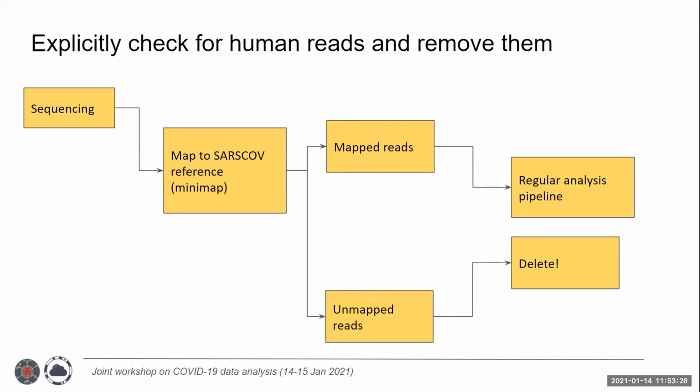The simplest solution is just a simple workflow like this, where you just map all the reads onto the SARS-CoV-2 reference genome and then remove all of the unmapped reads before public release. There are other methods like Kraken and so on if you want to try that.